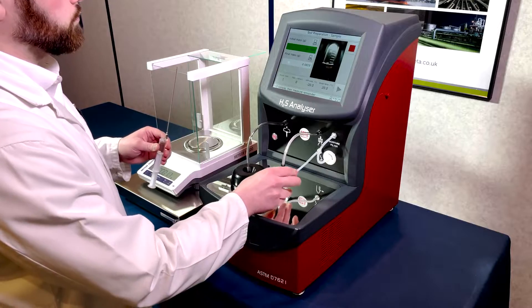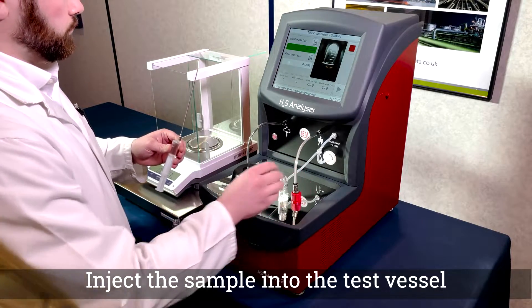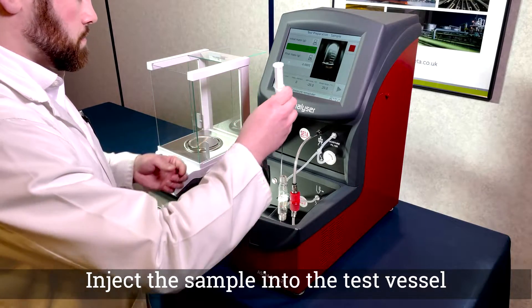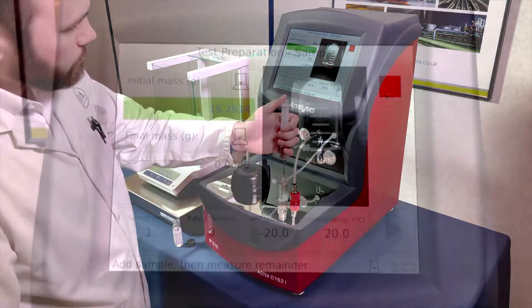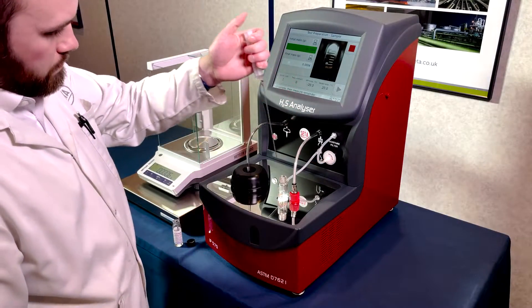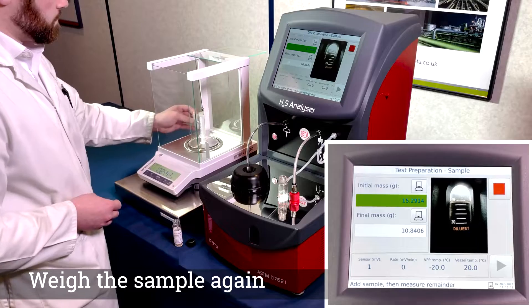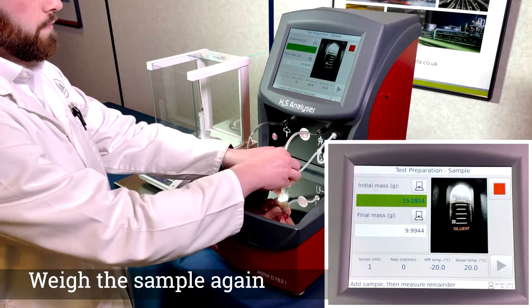Carefully remove the test vessel cap and add approximately five millilitres of sample in accordance with the method instructions. Once the sample has been added, re-weigh the syringe and manually input the mass when necessary.